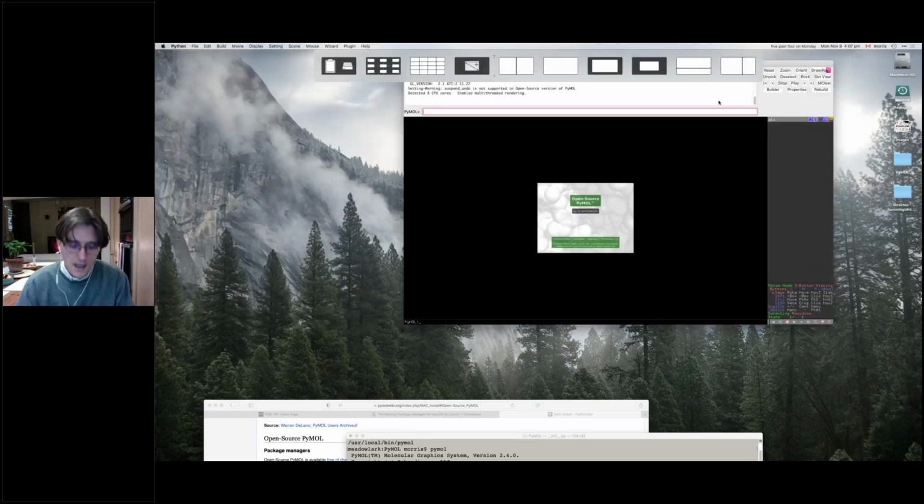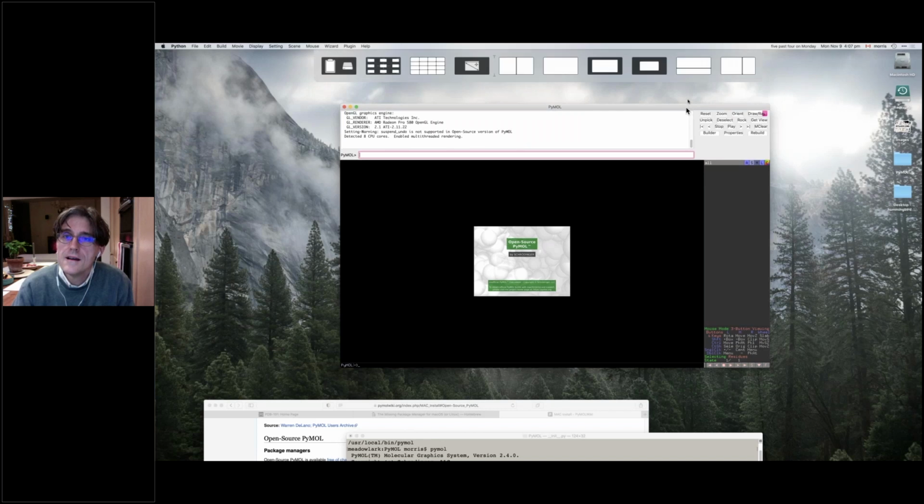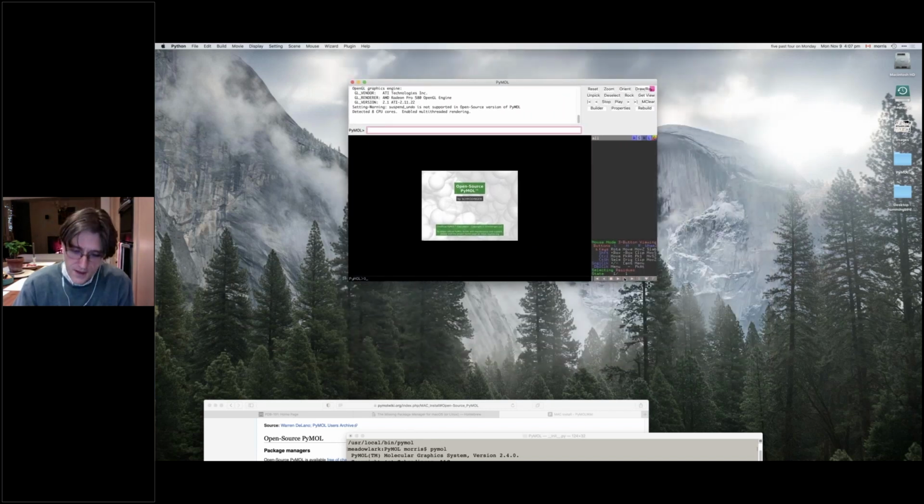Yeah, I think I can do that as well. Does that help? Yeah, a little bit, because I can artificially zoom in. I'm not sure if you're seeing it in the result. Do you see that? Is that zoomed up? No, I don't think so. Okay, it's just a special effect on my desktop, I'm afraid.